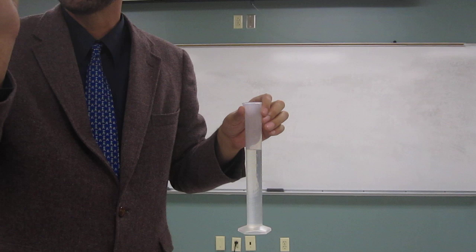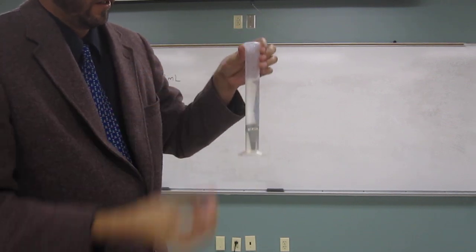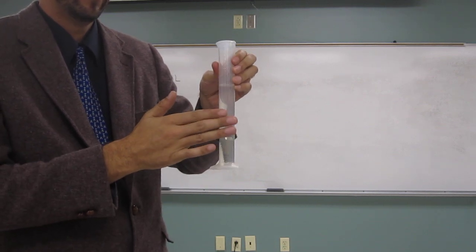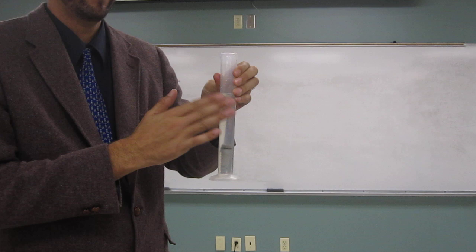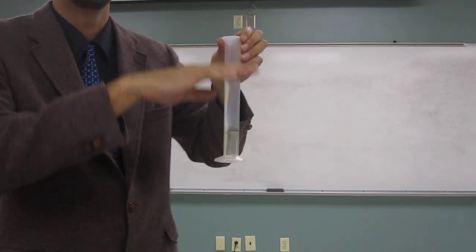Okay, and then what I do to figure out the volume is I'm going to drop this into the graduated cylinder. Okay, so notice, let's get all the air bubbles out of there. So what do you think happened to the total volume? What did it do?